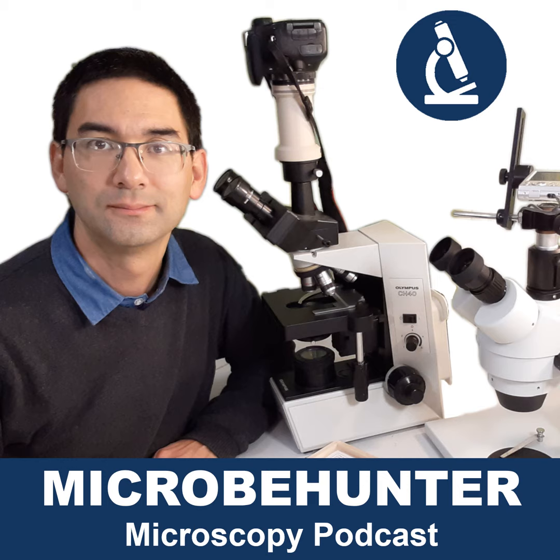So if you go microscope shopping, you can be a little bit relaxed, and as long as your microscope has 4 times, 10 times, and 40 times, you're already covered in 95% of the cases. Get yourself a 60 times objective for high magnification, and if you know what you're doing and go a little bit more advanced, get yourself a 100 times oil immersion objective. And if you want to look at a lot of water organisms, then I found the 20 times objective also very meaningful and useful. However, they're not quite as common, so you simply have to look around a little bit.